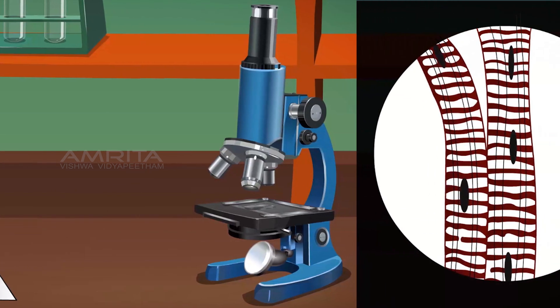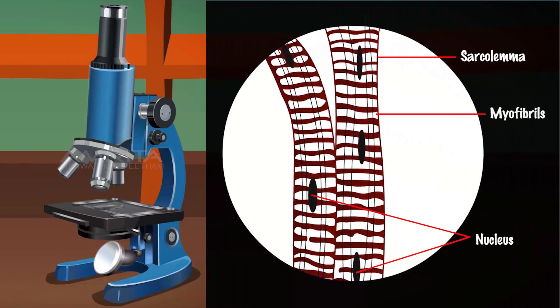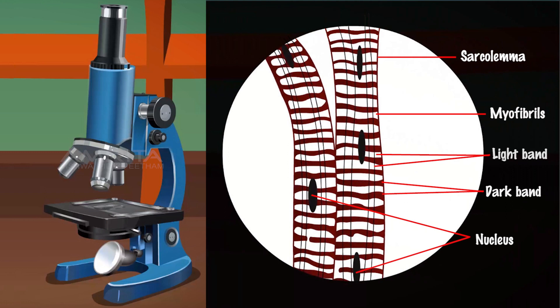Observations: The striated muscle cells are very long and have cylindrical fibres. The fibres are enclosed within a membrane called sarcolemma. These fibres are nucleated, which means they have many nuclei. Each cell cytoplasm consists of many myofibrils. Each myofibril contains alternate light and dark bands, giving a striated appearance to the fibres.